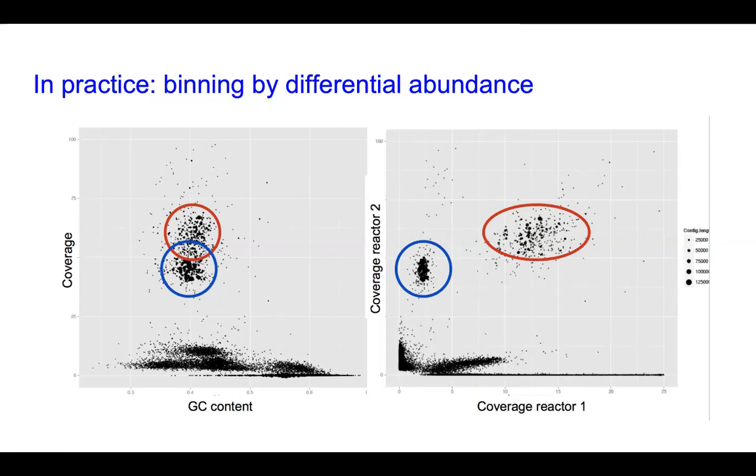The reason I say this is of note is that in this organism, several of the key genes for its metabolism are duplicated. These will, due to assembly chimera protection, be on their own contig with double coverage, and therefore typically not bin with the organism in question. So in this case, one of the key enzymes in metabolism is on one of these clouded dots. So even if you have a good quality genome, you might still be missing essential bits because they are duplicated.